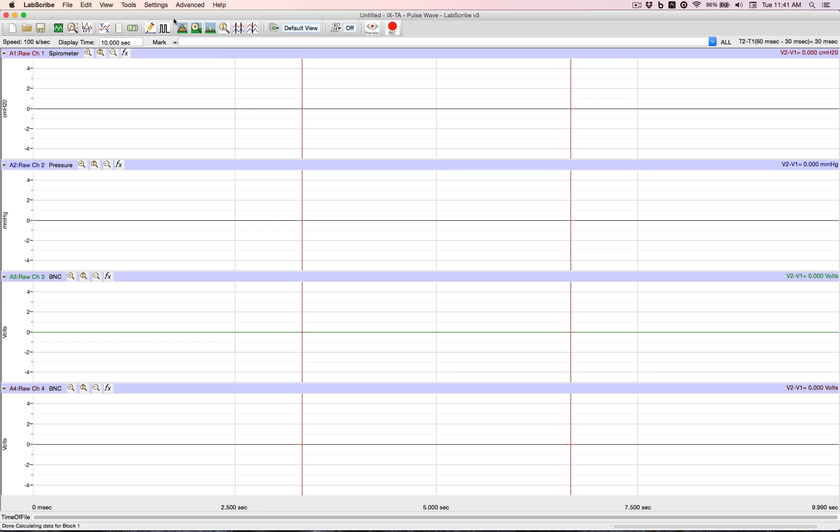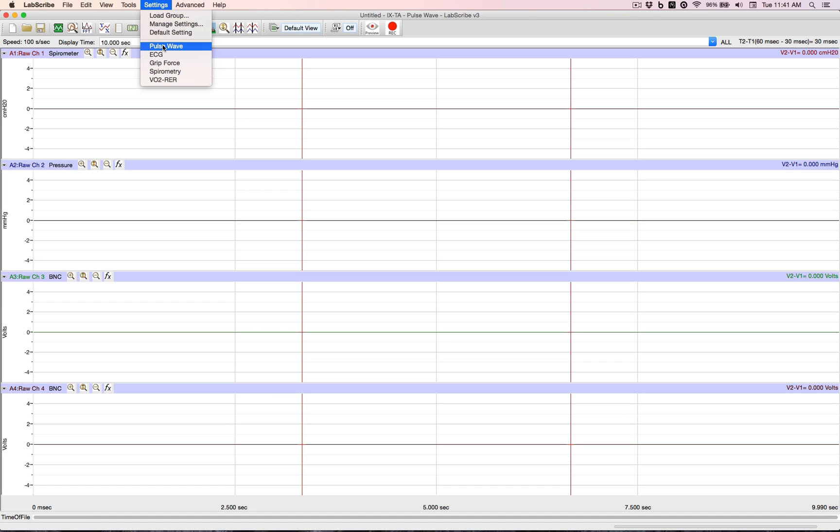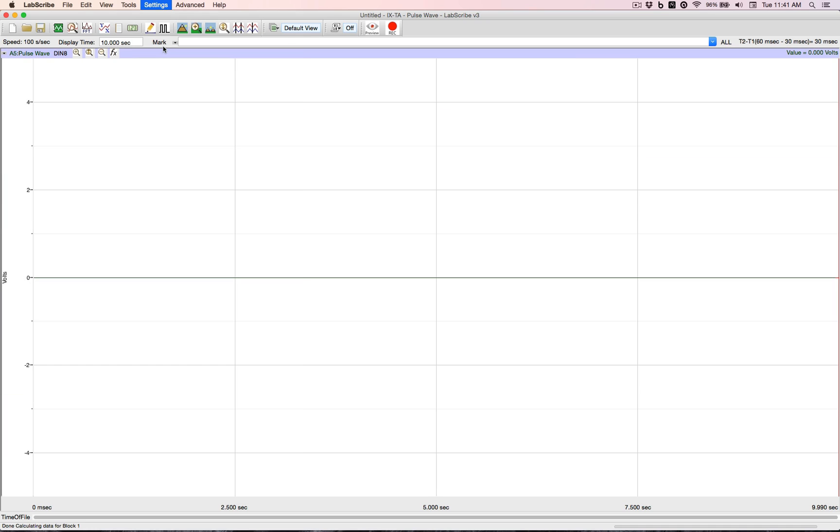We have a menu called the Settings menu. You click on it, bring it down, and I've got some settings here that I've set up for demonstration purposes. We have a pulse wave. I click on that, and it gives us one big channel.